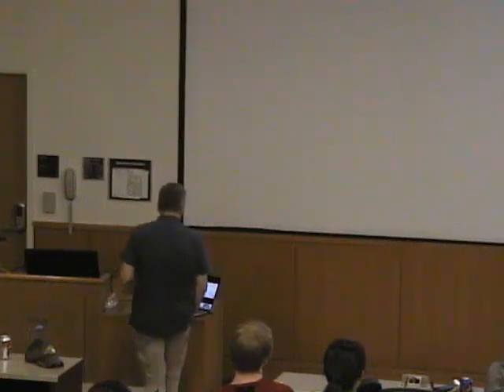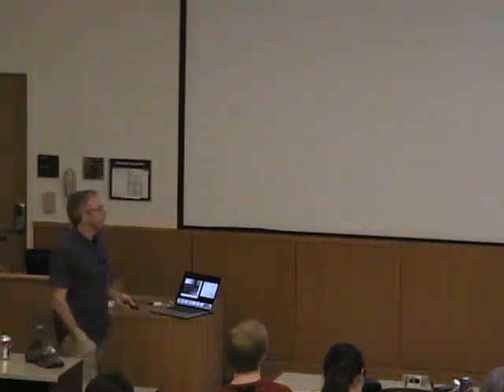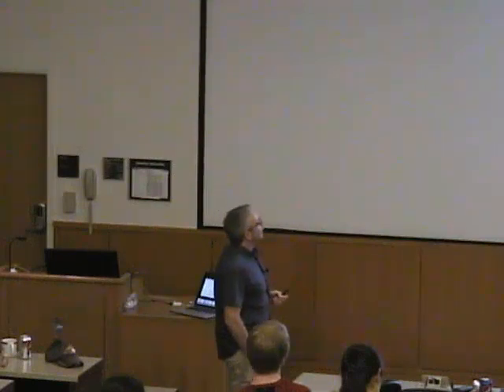Okay, now this is where we put our reflections, okay? This guy again. Question is, of course, if it's diffraction, why are we talking about reflections all the time? What is this? It's not a reflection. It's a diffraction process, and yet we speak about reflections. Okay. And that is because we have a super simple way of calculating where these reflections should be. I'm not pulling out any Hamilton operators. It's almost shamefully simple. But what it took was the concept of lattice planes.